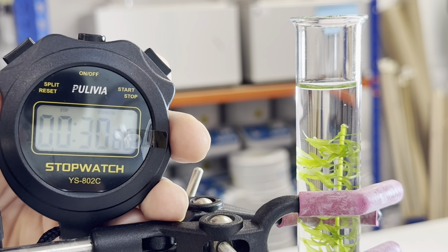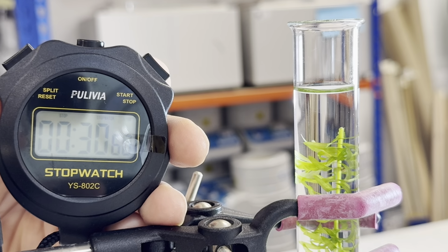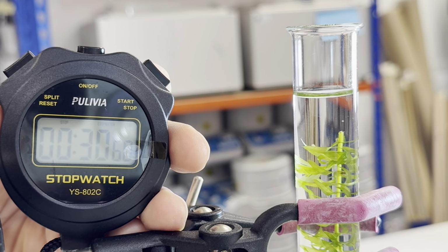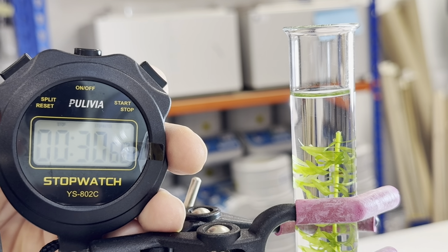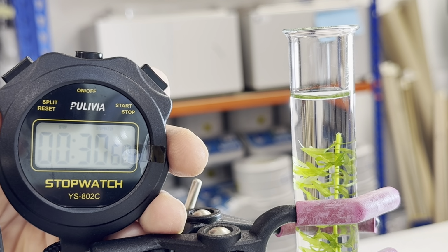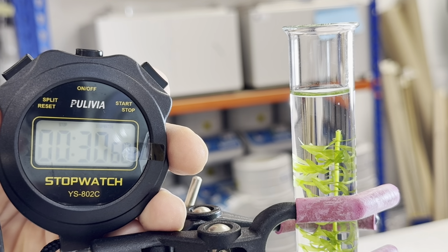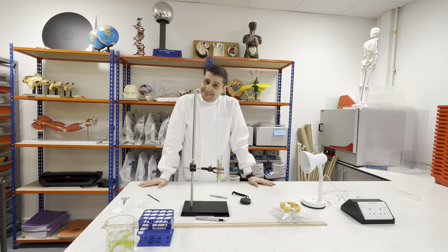So we can see that if I increase the distance, the rate of photosynthesis decreases. This is exactly what is expected. So if I increase the intensity of light, the rate of photosynthesis increases. If I reduce the level of light, I reduce the rate of photosynthesis. The variable here is the light, because the plant is still the same and the CO2 in the water is still the same.